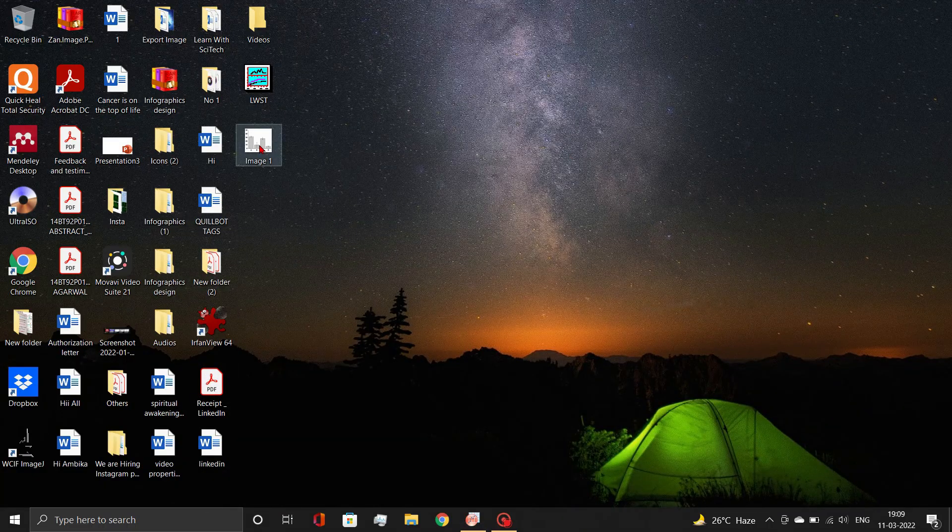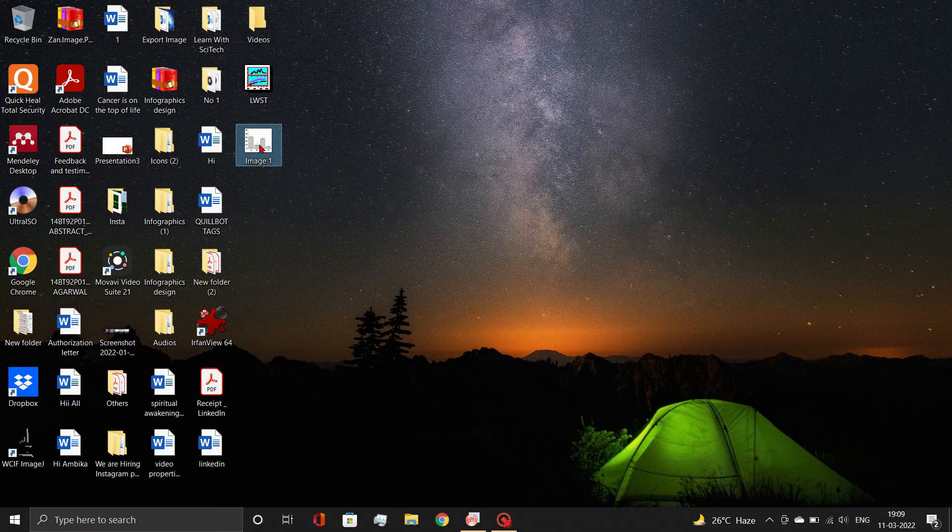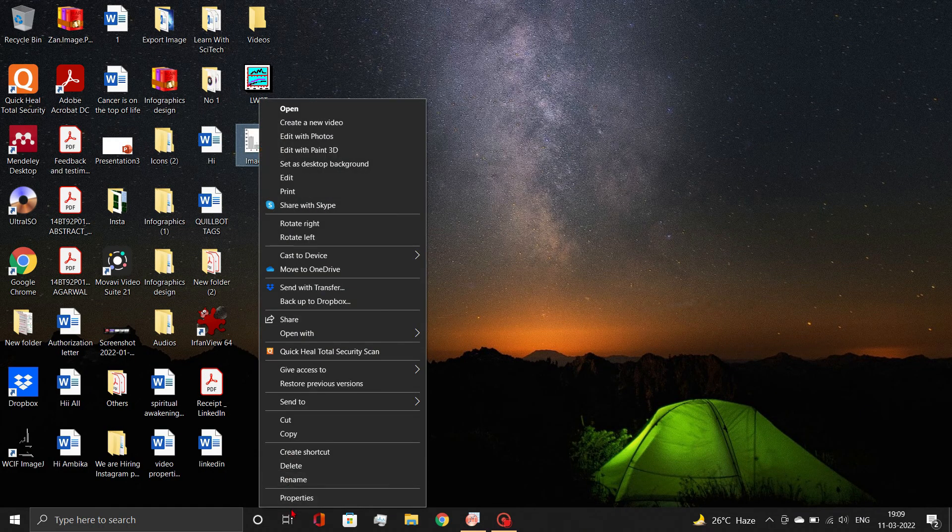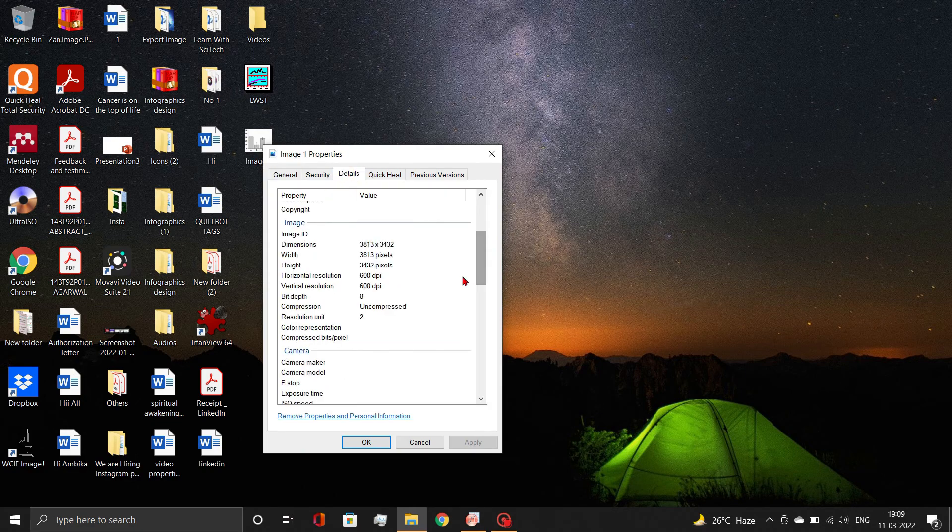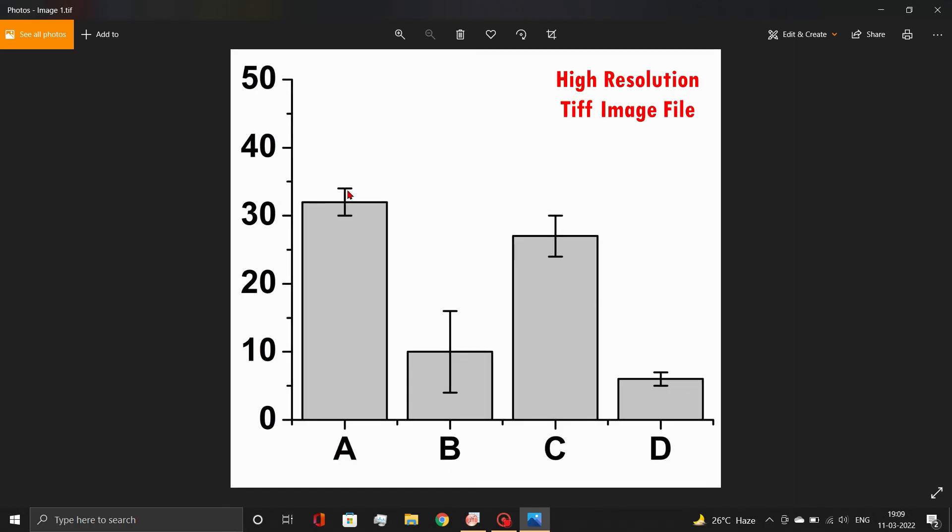Now let's check the exported image file. The resolution of this image is 600 dpi and the quality is quite high. Check out our previous video to know why we recommend to change the canvas dimension size before exporting graphs.